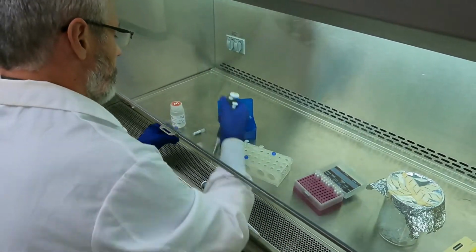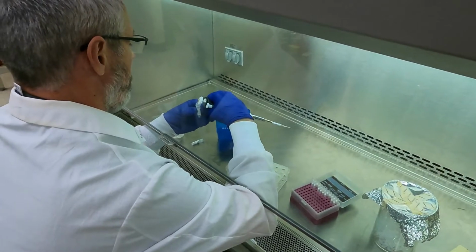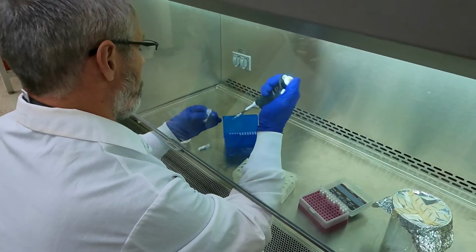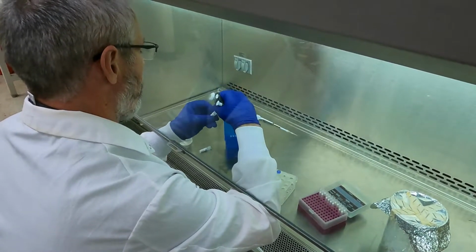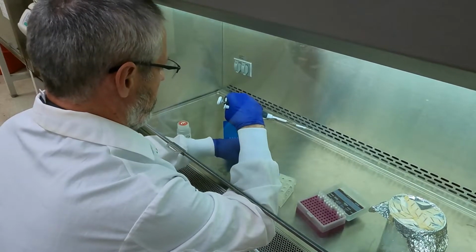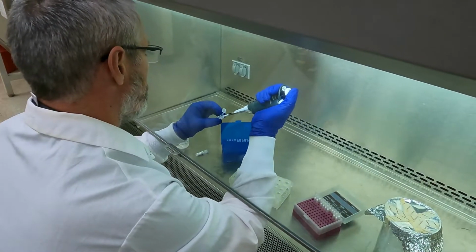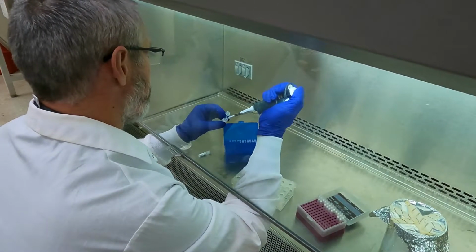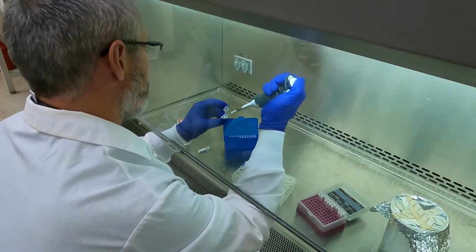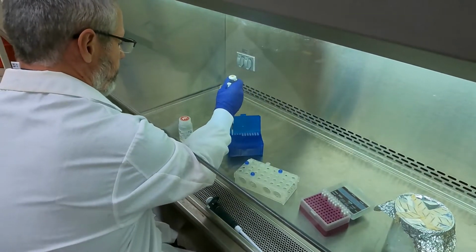C16, 5 microliters of this. Straight to the bottom, mix it up and down. And then again to the CU.